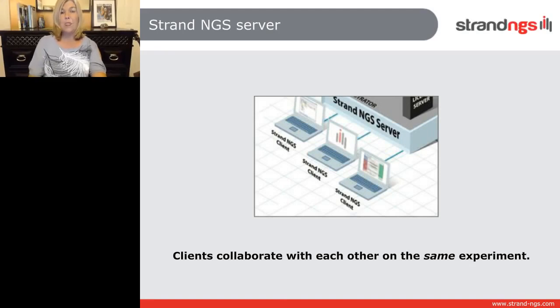Looks like we have another set of great questions coming in. Does Strand NGS Server support only DNA sequence, or are there other options or other workflows?